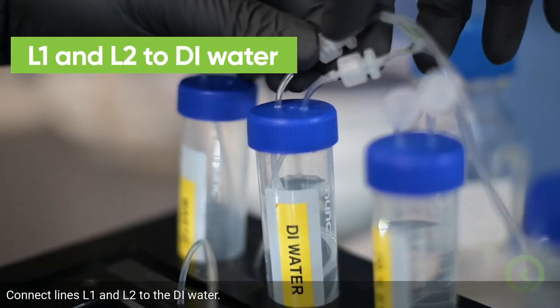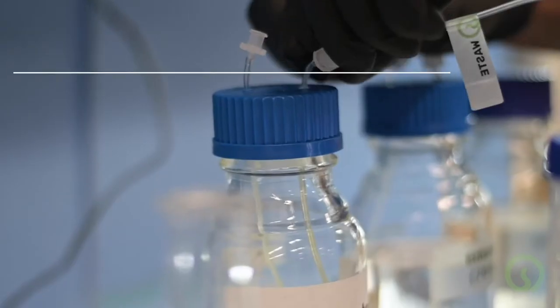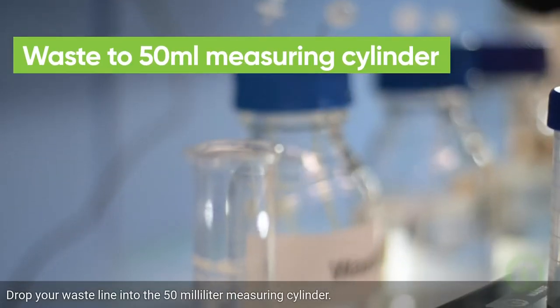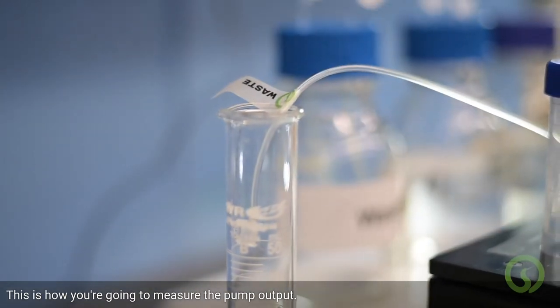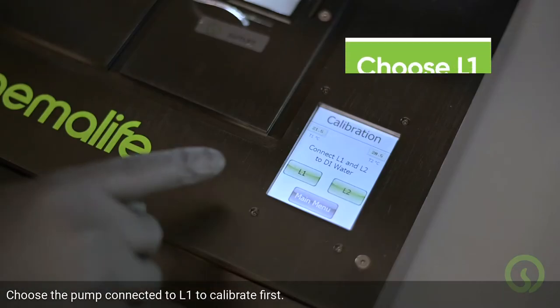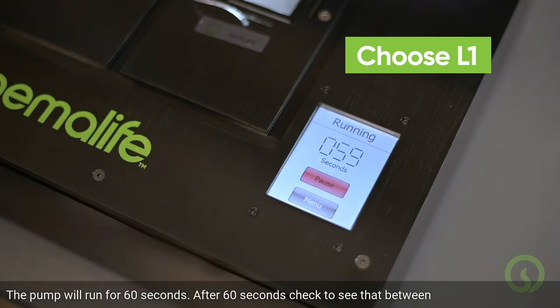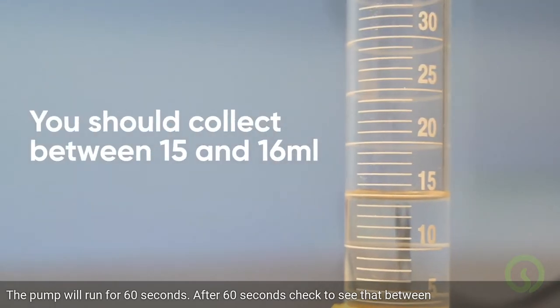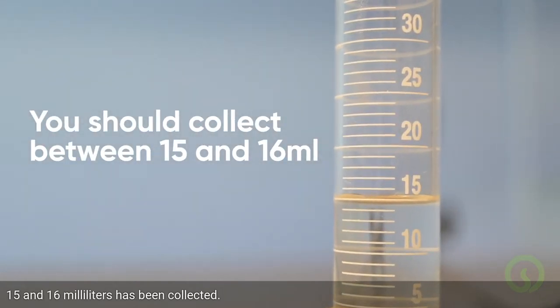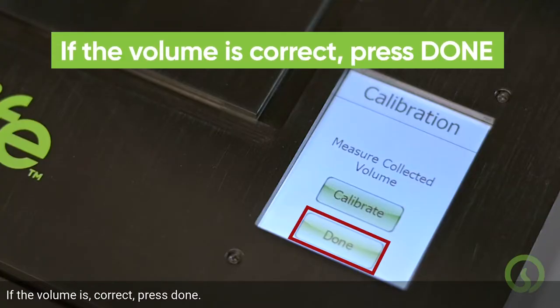Connect lines L1 and L2 to the DI water. Drop your waste line into the 50ml measuring cylinder — this is how you're going to measure the pump output. Choose the pump connected to L1 to calibrate first. The pump will run for 60 seconds. After 60 seconds, check to see that between 15 and 16ml has been collected. If the volume is correct, press Done.